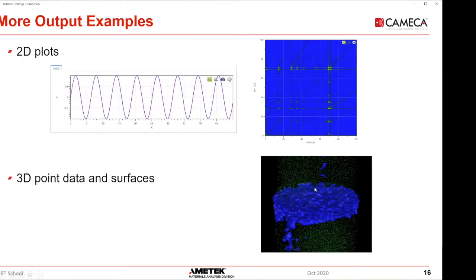You can also do a 3D display of your choosing. You can have point data or surfaces, or even primitive types like spheres and cones and arrows, that sort of thing. It's all available through that view builder interface that we're giving you.